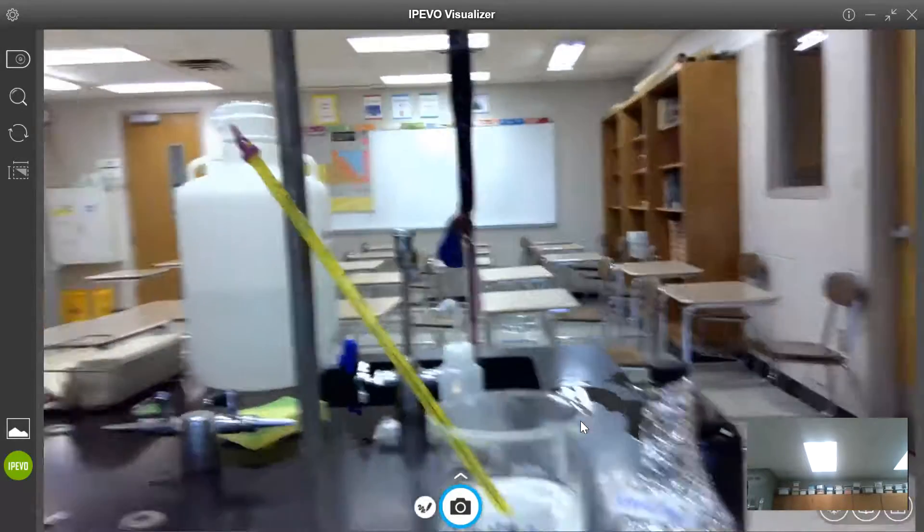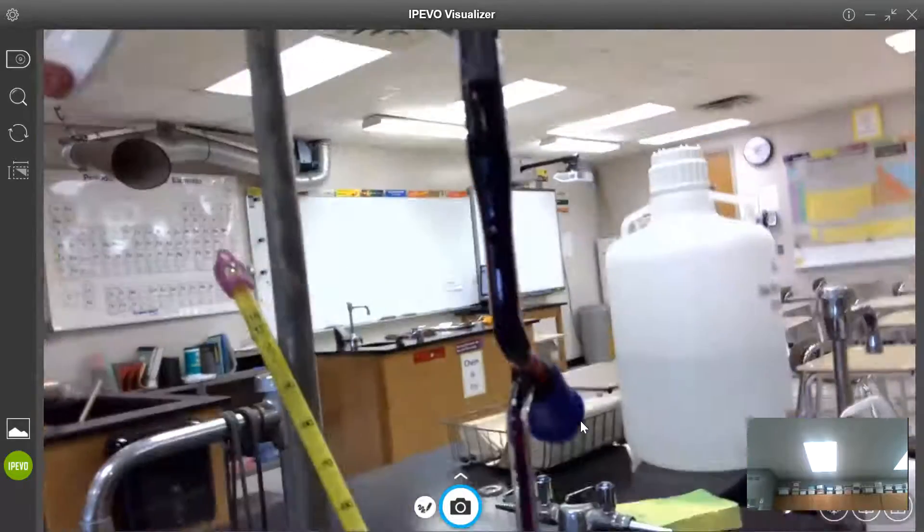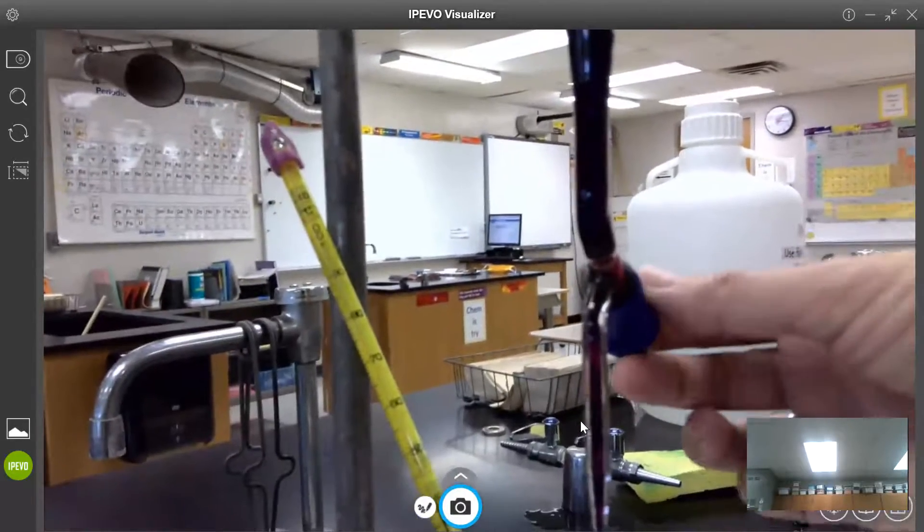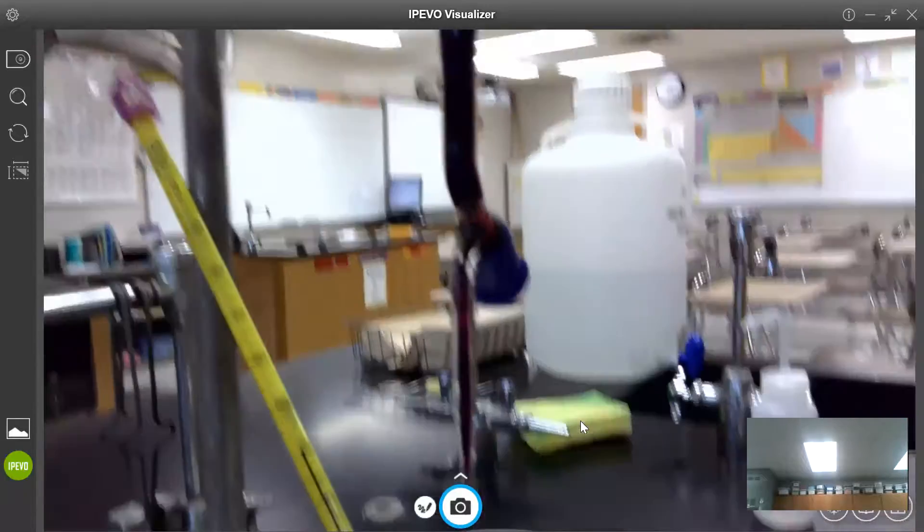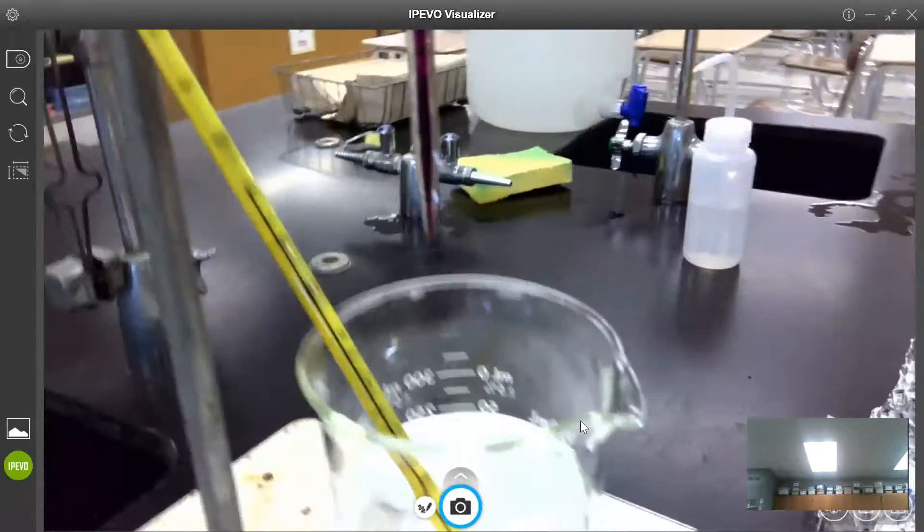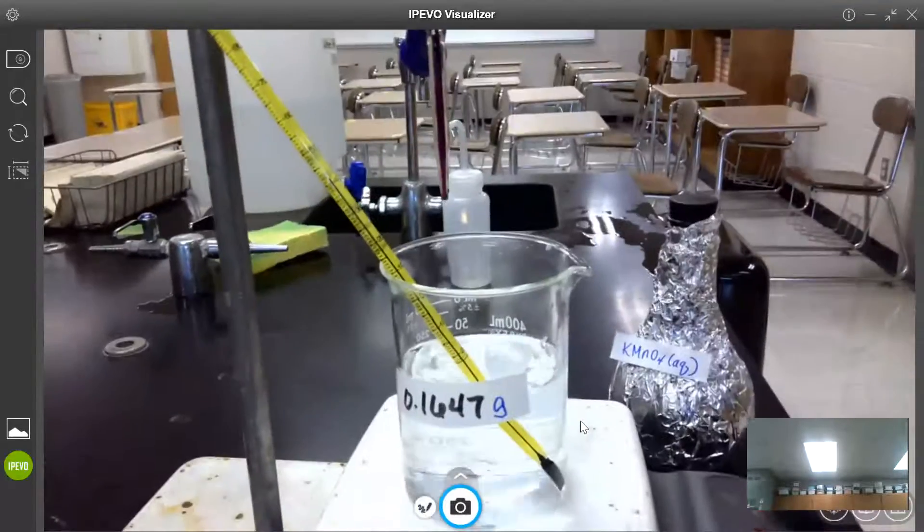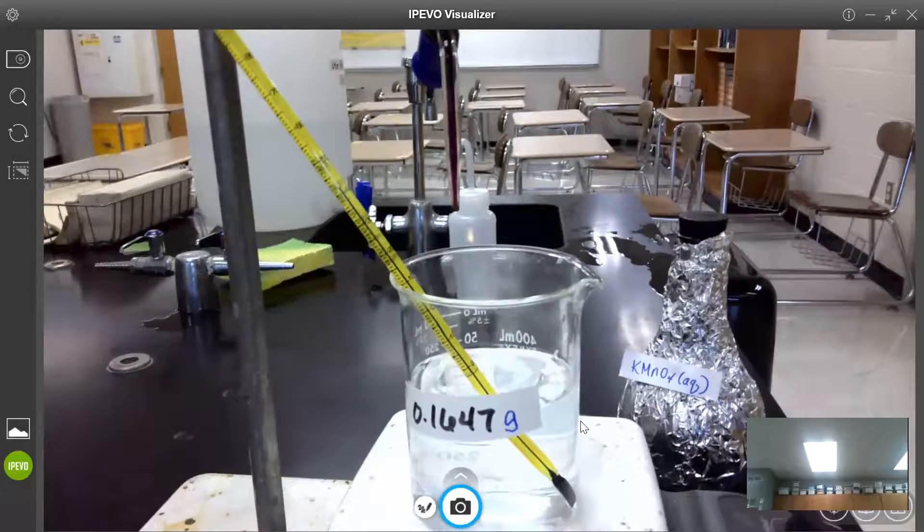And at the bottom of this you can see that we have this valve, which is how we're going to add the KMnO4 to the titration. So mostly we're going to be focused on what's happening here in the beaker and at the bottom of the burette.